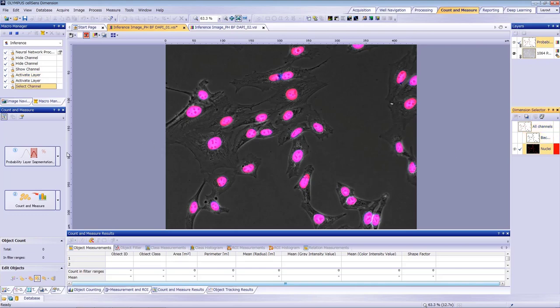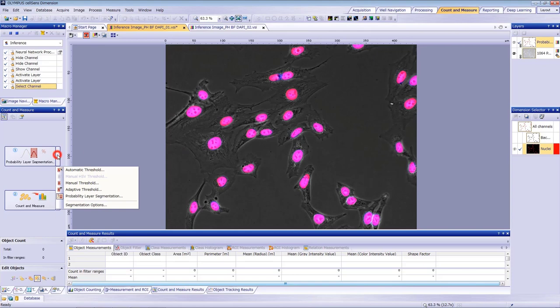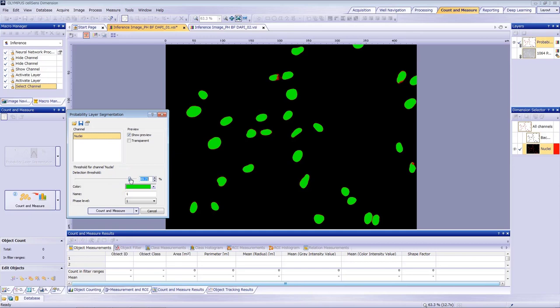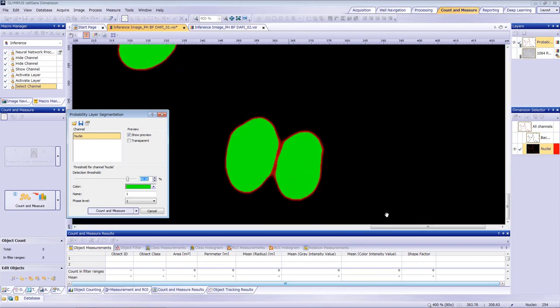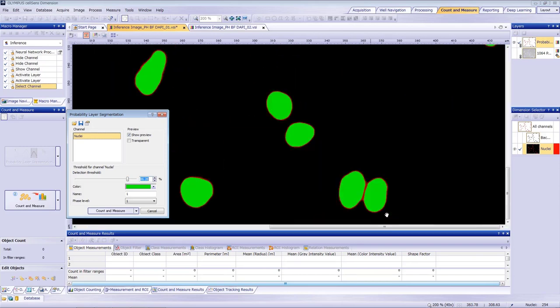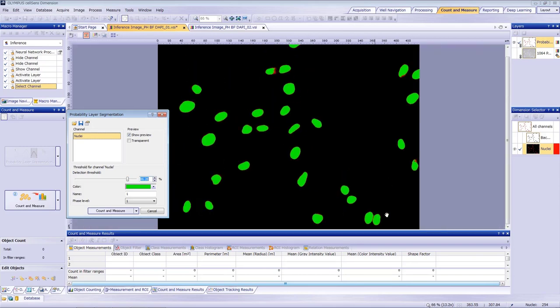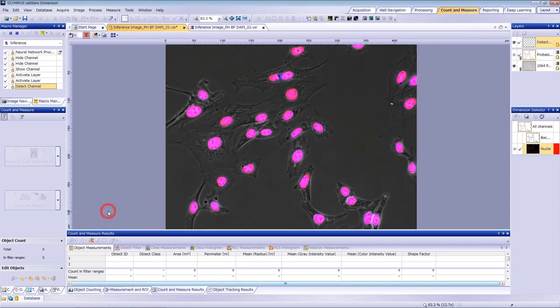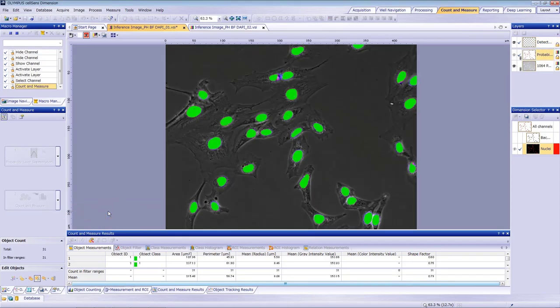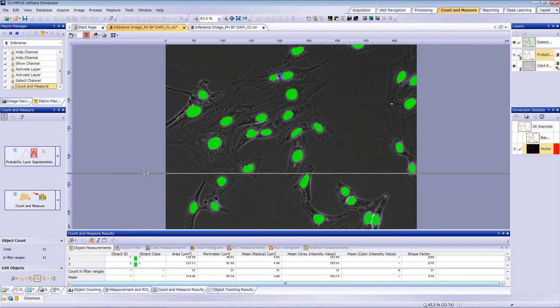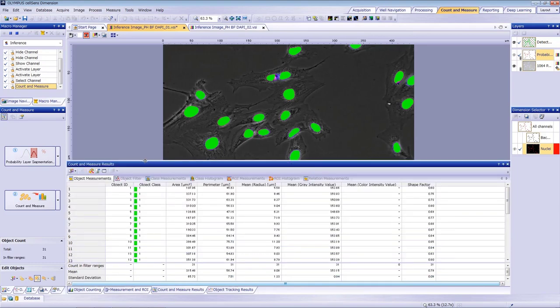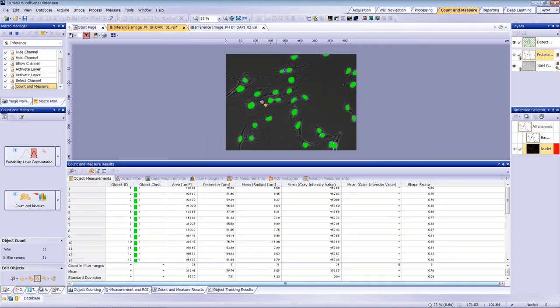You can conduct additional analysis using the count and measure module. Click to activate the probability layer. A probability threshold will be applied to the nuclei. Set the threshold so that two close nuclei are properly split and so that all nuclei are properly detected. The measurement results for each object are shown in the chart. At this point, you can stop the macro recording. Confirm that the detected object layer has been created.